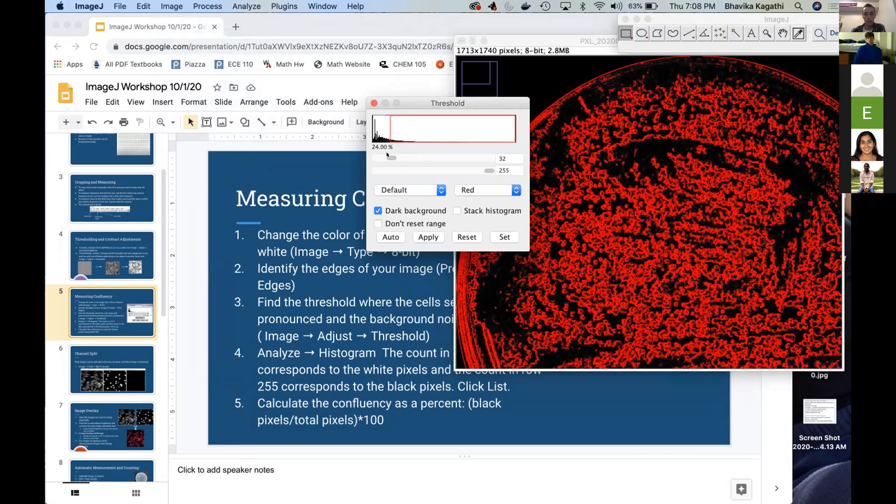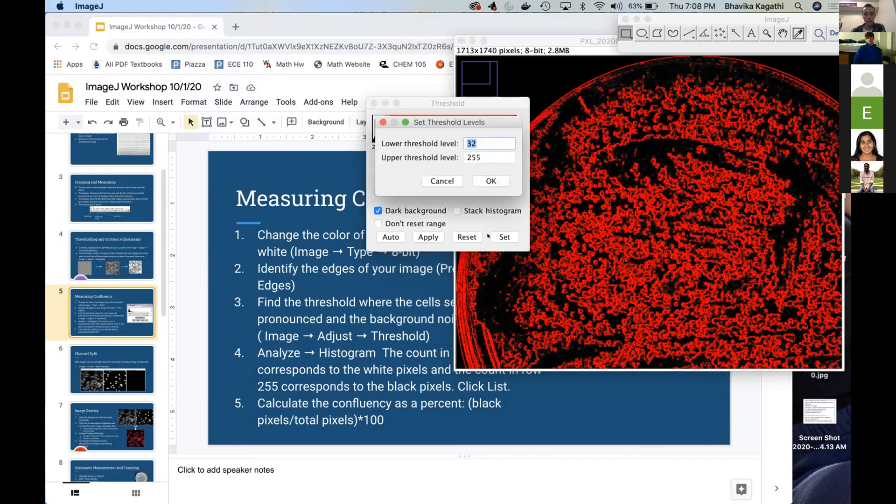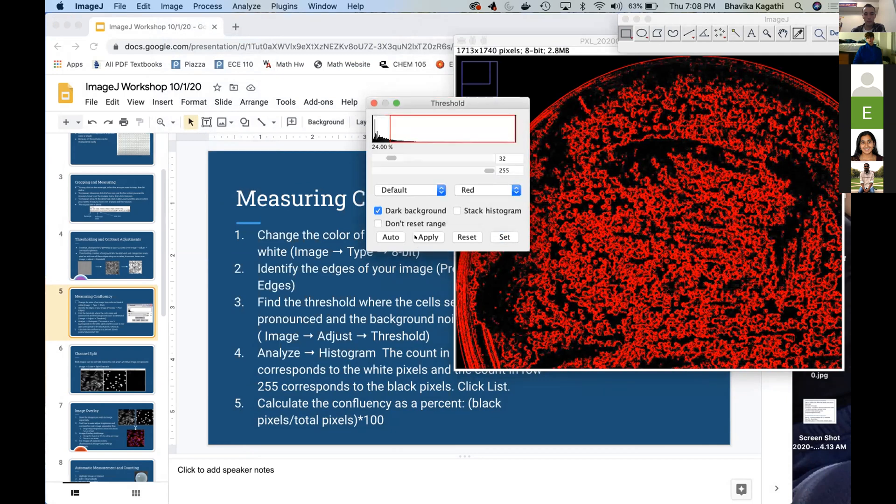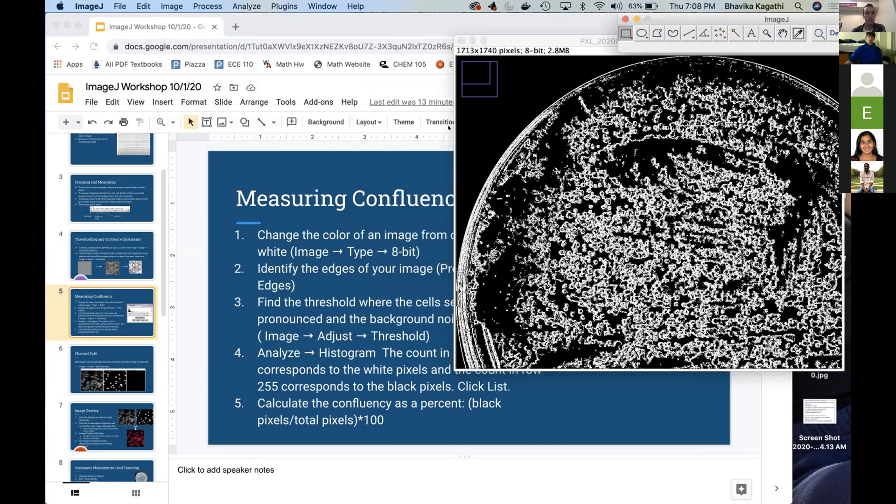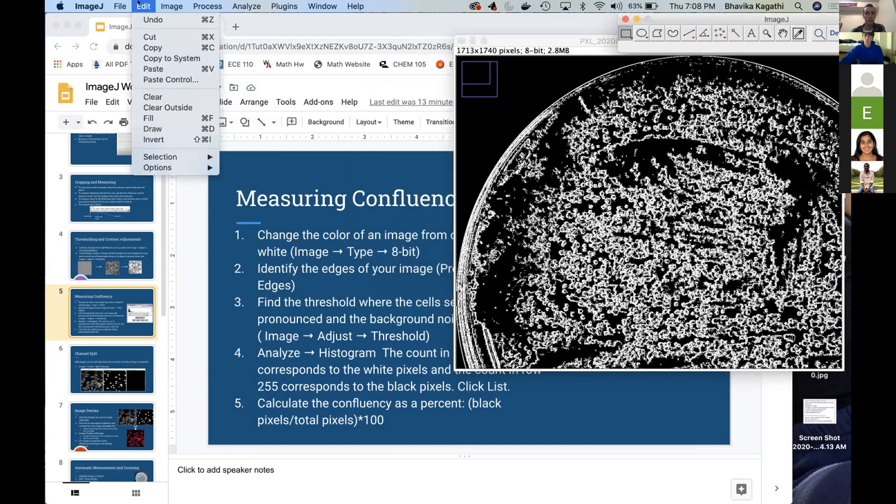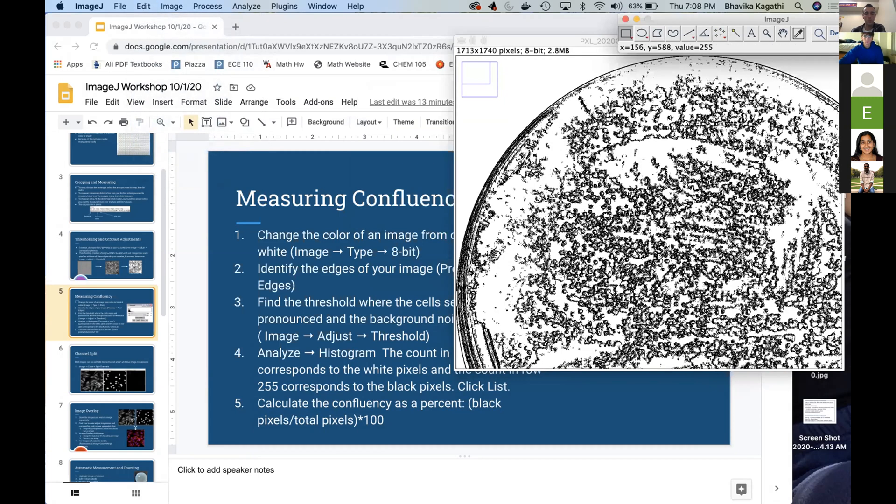something like this, you would do Set, and then Apply. And then here all the cells are actually white, so we want to make sure to invert it. So Edit, Invert. And so now all our cells are black, which is what we want in order to find the confluency.